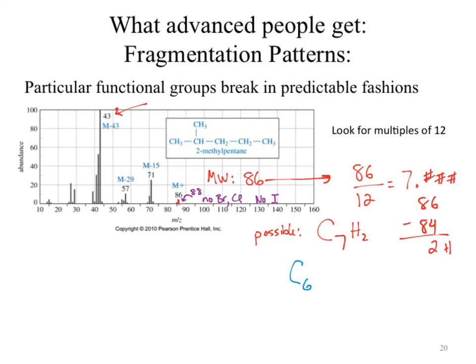And then we have to account for the mass of that carbon, so we add 12 more hydrogens, and we get C6H14. This is now a more likely structure. Could we remove another carbon? Theoretically, why not? We'd end up with C5H26. Is that a possible structure?